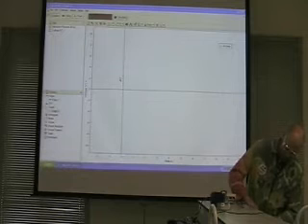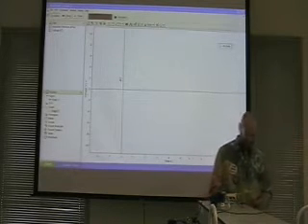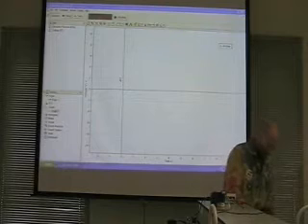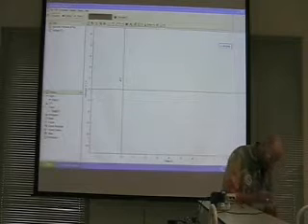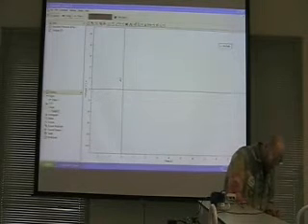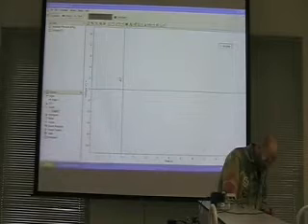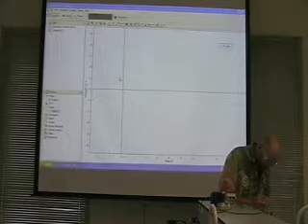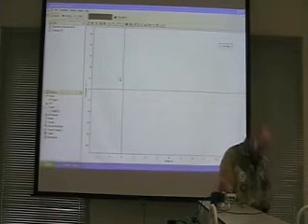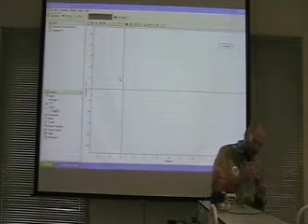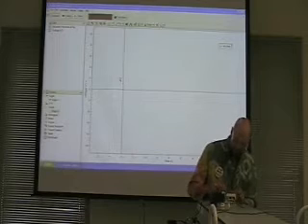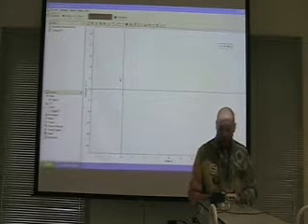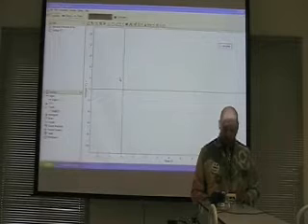Now, get everything ready. So about one milliliter of that. About one milliliter of that. A little bit of water, not much. Put it in there. It's ready to go, as far as I know.